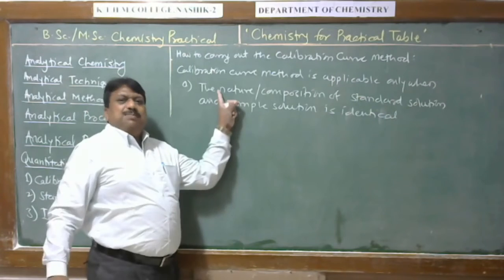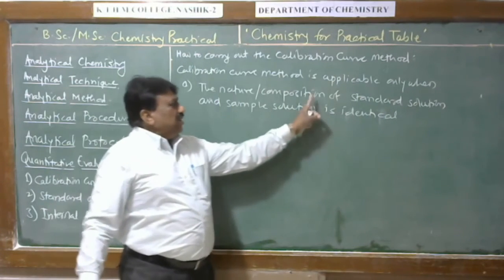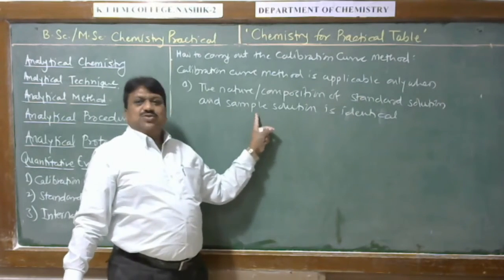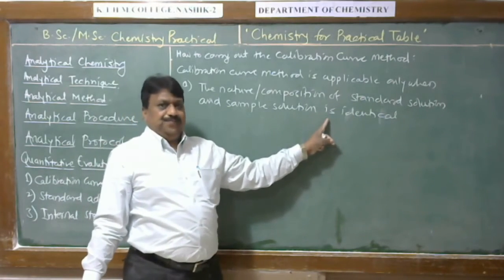Calibration curve method is applicable when nature or composition of standard solution and composition of sample solution are exactly same.